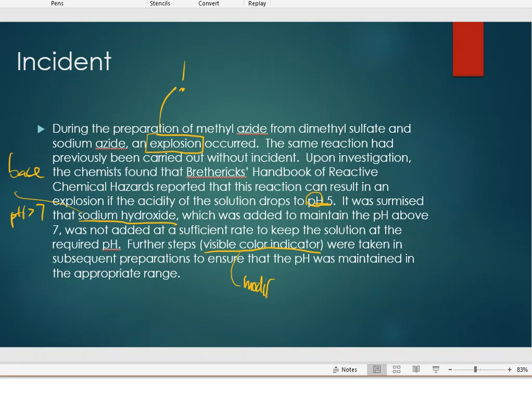If we see a mistake that could happen in a laboratory, and this is a prime example of a random mistake, this modification to the method can help prevent this explosion in the future. And it's actually surprising that this wasn't done beforehand anyway. If it is pH dependent, an indicator does nothing to the reaction. It's just something visual that we can see straight away.